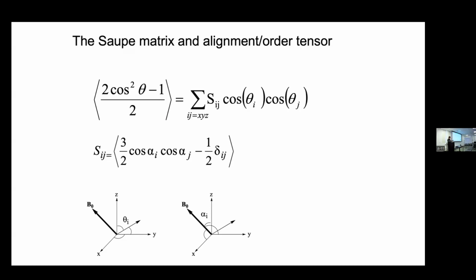And those 5 numbers end up being a tensor, which has an orientation and 3 orthogonal axes, X, Y, and Z. Each axis has a certain length.